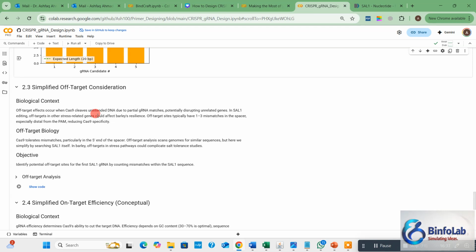For example, you design a gRNA, or a guide RNA, for CRISPR for a hypothetical location 120 nucleotide. In this case, if your RNA is also matching to position 200 downstream, you will think that the gRNA will bind to the template DNA at 120, but no, it will bind to the 200 location.